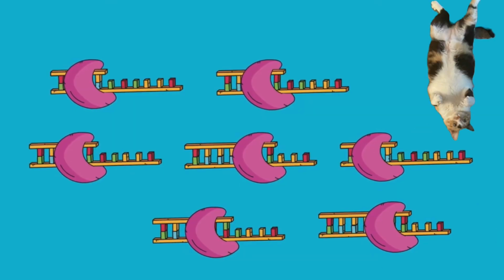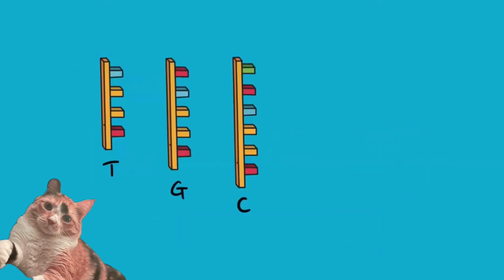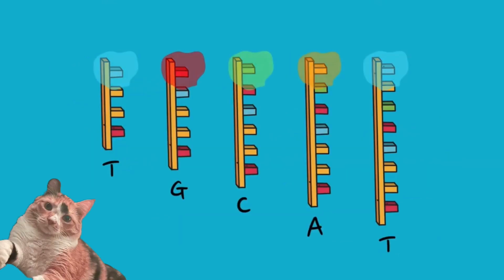Multiple chains are created, each with their own dideoxynucleotide at the end. With these strands, they are then assorted by length. The fluorescence, each color associated with a particular nucleotide, will reveal the final sequence of the DNA.